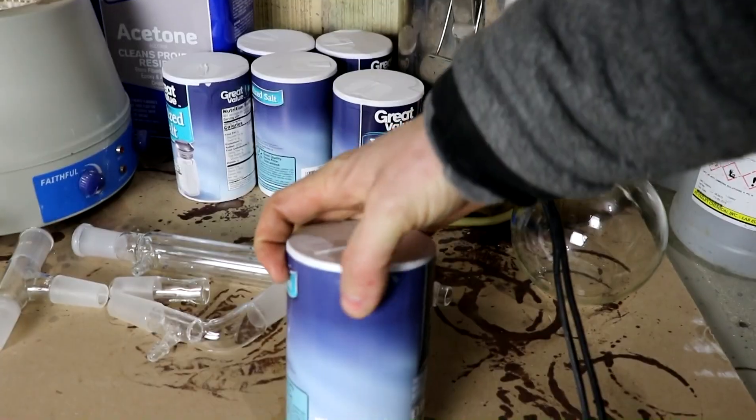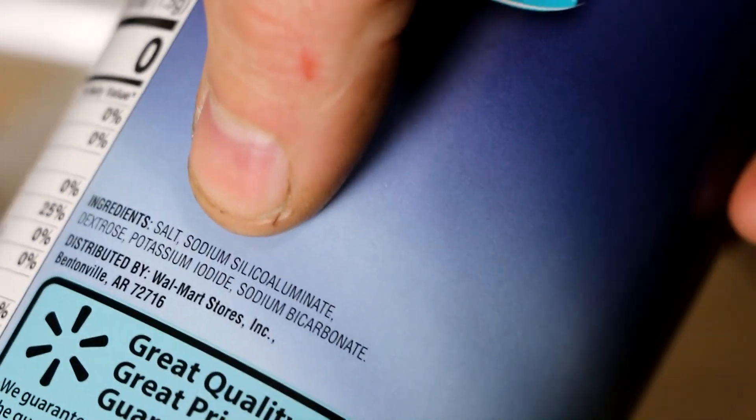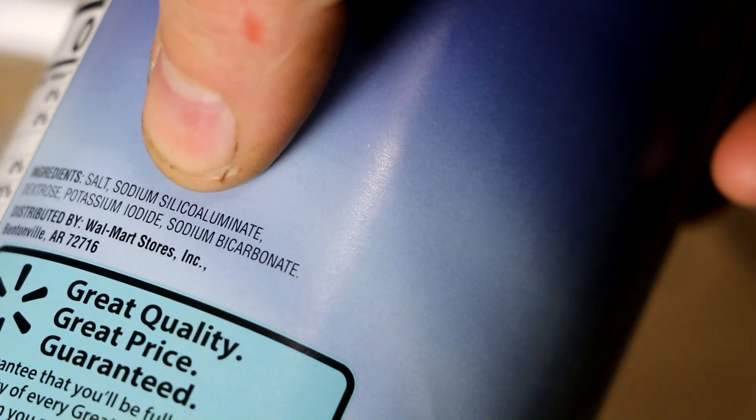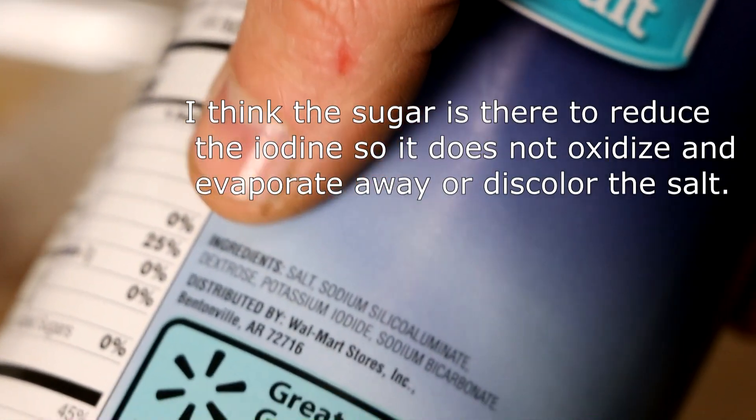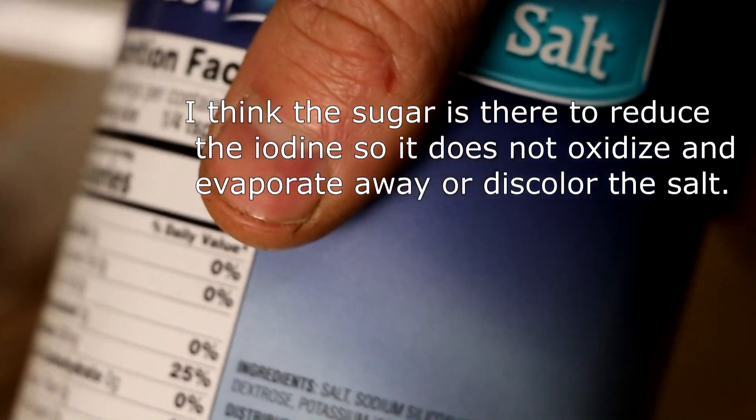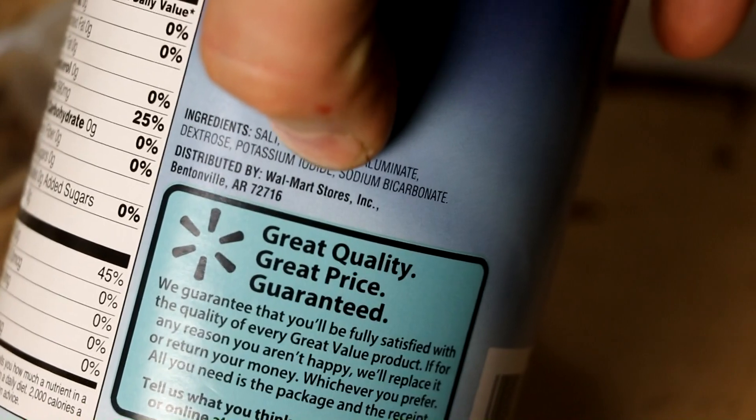Let's have a look at the label real quick. Zoom in here so it has salt, obviously this is a can of salt. Sodium silicoaluminate, so that's your anti-caking agent. Dextrose, a little bit of sugar in there, that's interesting. Potassium iodide, that's the stuff we want to get out.